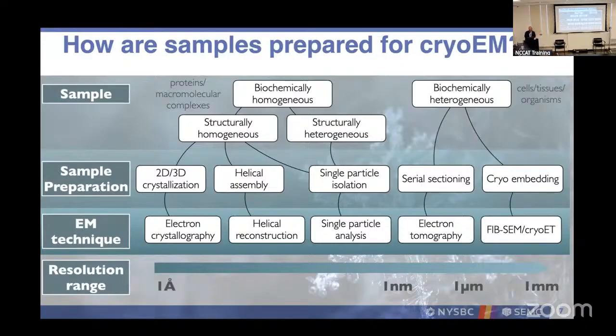What's the biggest complex that you've seen at this location? Is it under 100 nanometers? Well, we have collected on things over 100 nanometers, but for single particle approaches, even on tomography milled samples, they try to aim around 100 nanometers because you have the best contrast and the best resolution. You can go thicker, and you can use other instruments, not here, and go thicker. It's just that you would have more moderate resolutions.